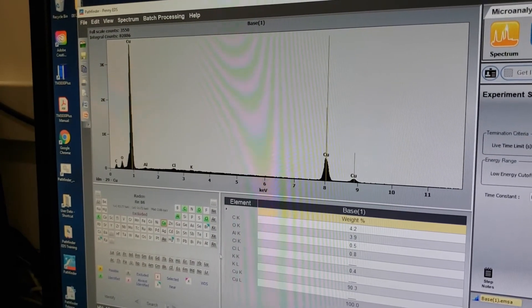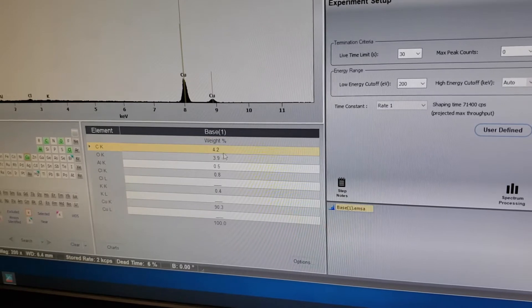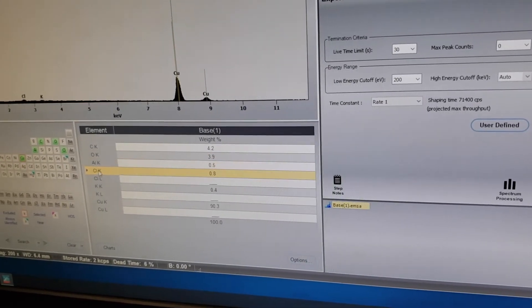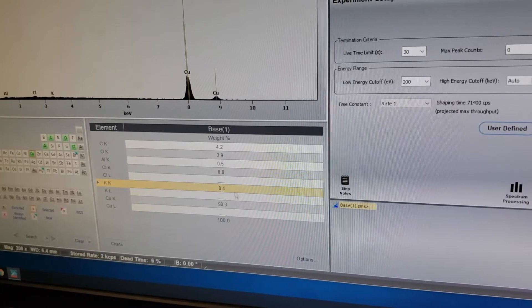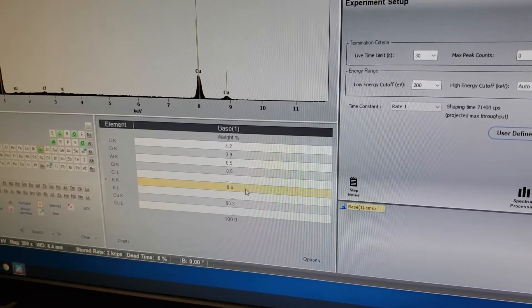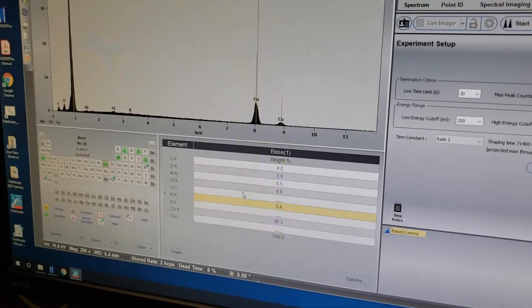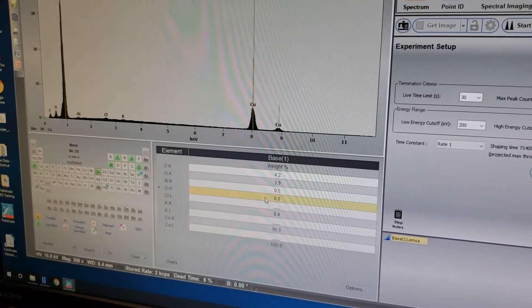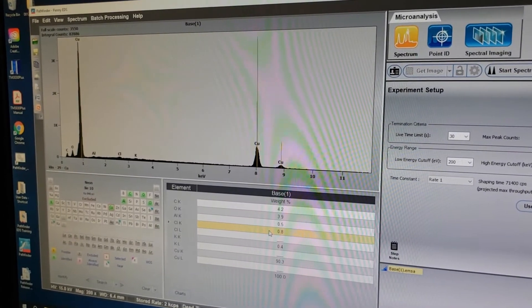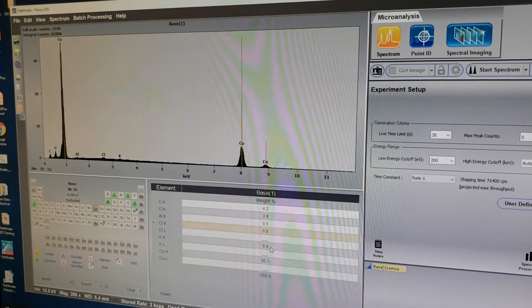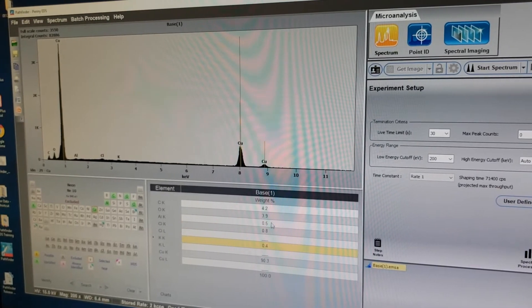Down here are the results from the spectrum showing weight percents. We have about 4% carbon, about 4% oxygen, and aluminum, chlorine, and potassium are all less than 1%. Depending on your sample and your level of knowledge about it, I would disregard these. Anything less than 1% is too small for our detector to reliably detect. Unless you have a calibration standard, I would not recommend reporting aluminum, chlorine, or potassium.